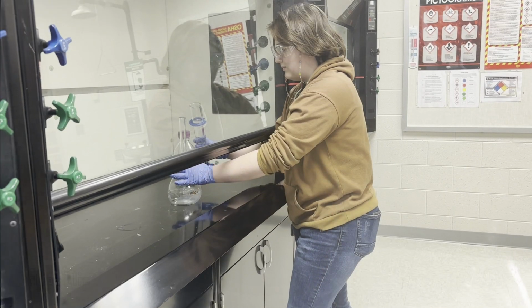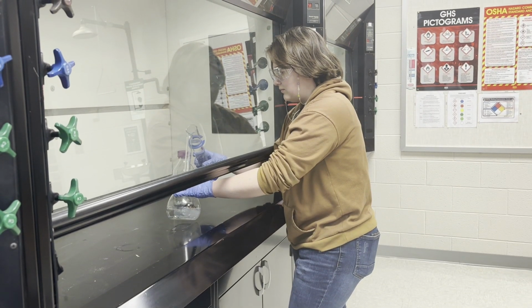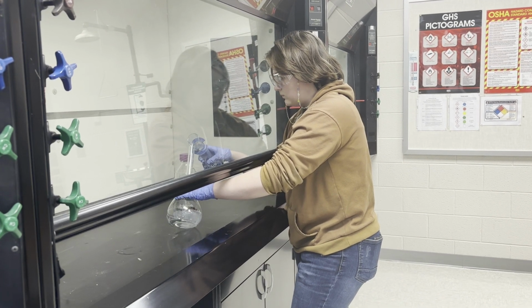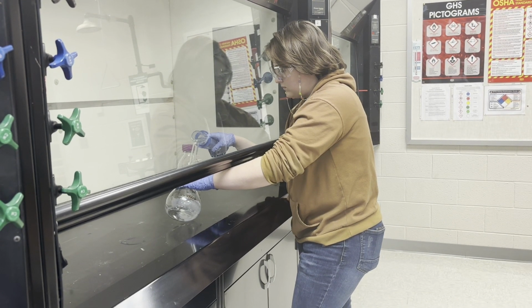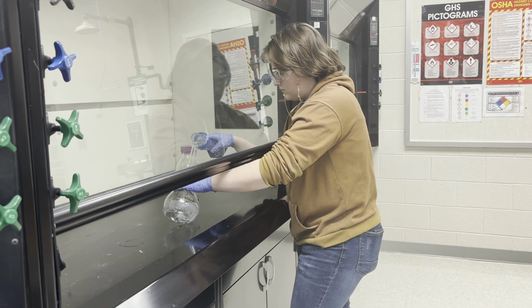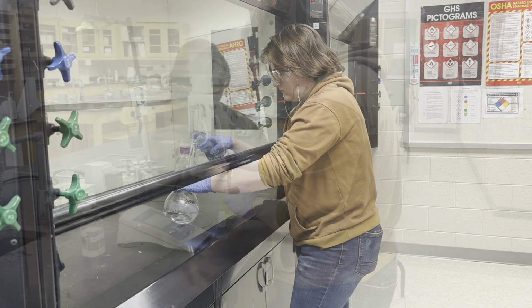7. First, we created stock solutions, which we could then process to get the specific pHs we needed. To make the stock solutions, we prepared 1 molar nitric acid and 2 molar sulfuric acid solutions. We started by adding about 800 milliliters of distilled water to the container. We slowly added 111.1 milliliters of concentrated sulfuric acid while stirring, then carefully added 62.5 milliliters of concentrated nitric acid. We stirred thoroughly to mix and topped off with distilled water to the 1,000 milliliter mark.